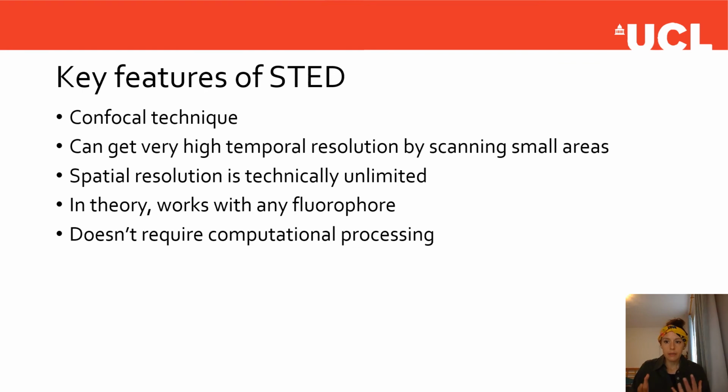So the key features of STED are it's a confocal technique, and it has all those benefits of confocal microscopy. Optical sectioning, you can get very high spatial and temporal resolution if you scan a very small area, and it should work with any fluorophore as long as you've got the right wavelengths for excitation and depletion. All fluorophores are capable of undergoing STED. It's just a fundamental photophysical process, stimulated emission.